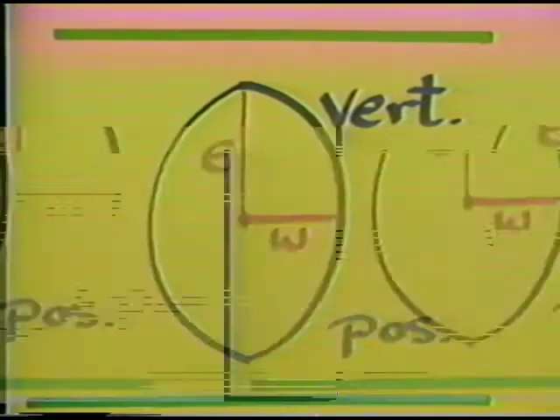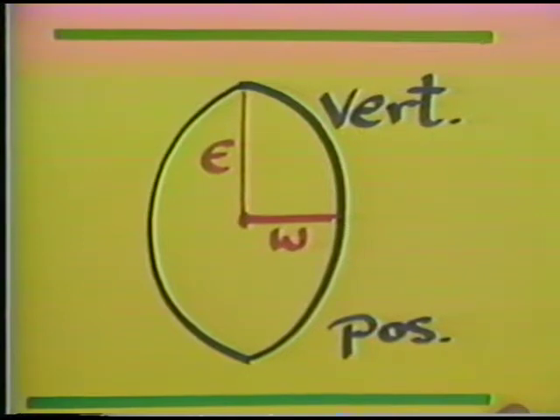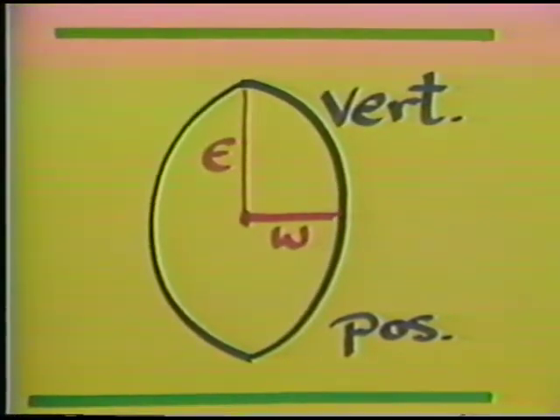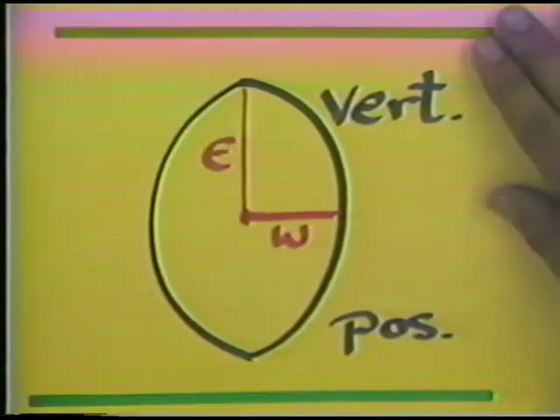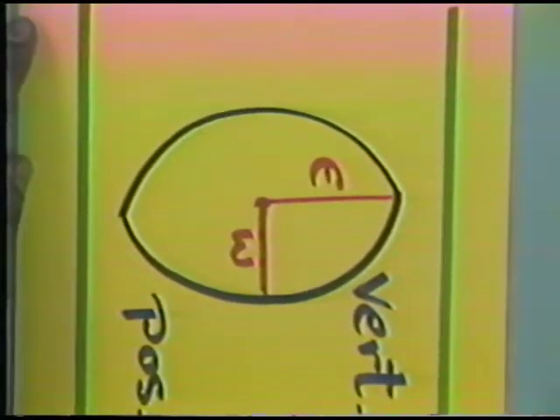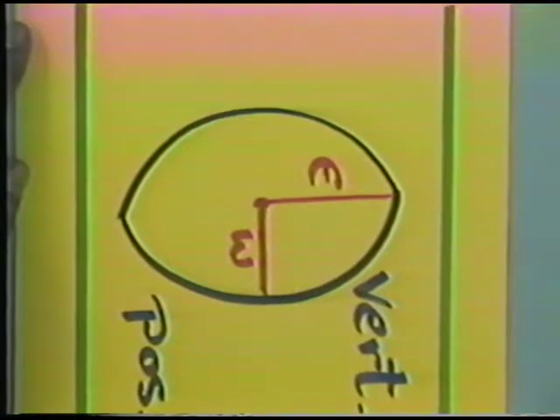When the C-axis of the mineral is on the stage, then it's possible, if you can recognize the position where you are, to rotate the mineral grain until you have coincidence of one or the other vibration direction with the microscope polarizer.